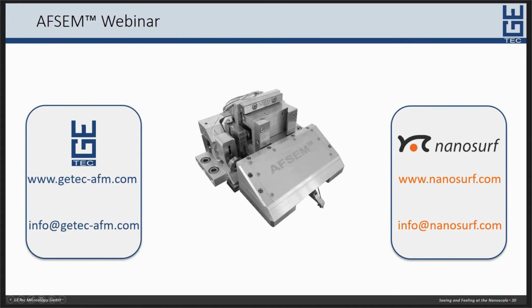Then there were a few questions concerning how we can combine the SEM image with the AFM image. So the correlation has to be performed afterwards, meaning after measuring your sample with the AFM and the SEM.